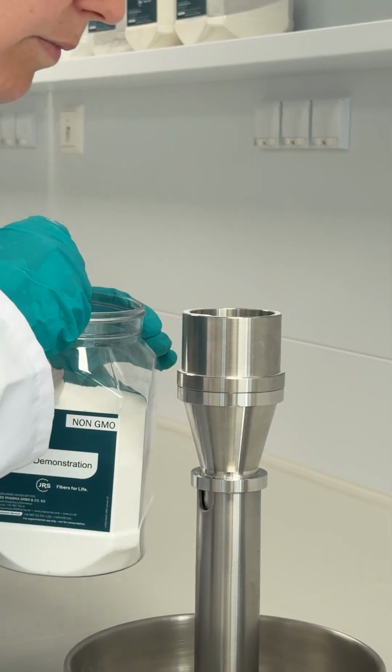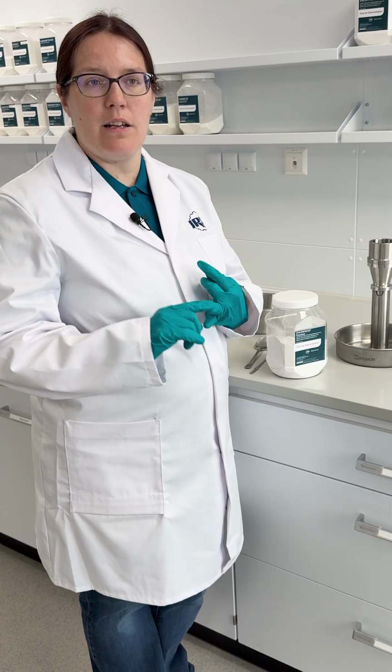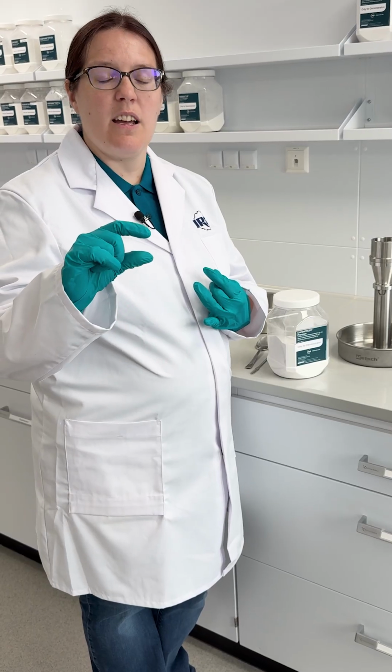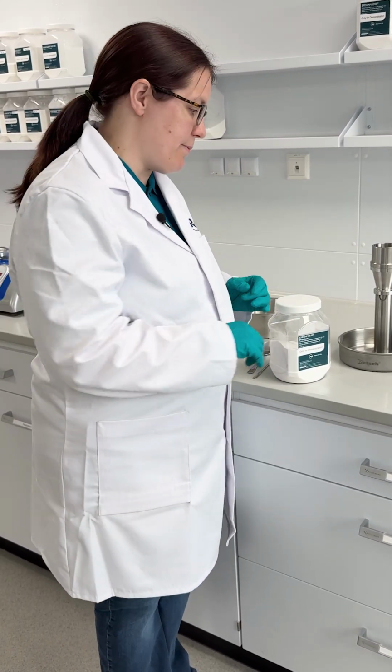Bulk density is a measure of how much space a certain weight of material will occupy. So that's including the air voids that might be between particles at their most expanded. This is important, for example, for the max weight that fits in the material hopper, or also for the maximum amount of weight of material that fits in the die, because of how much space that material's weight takes up.